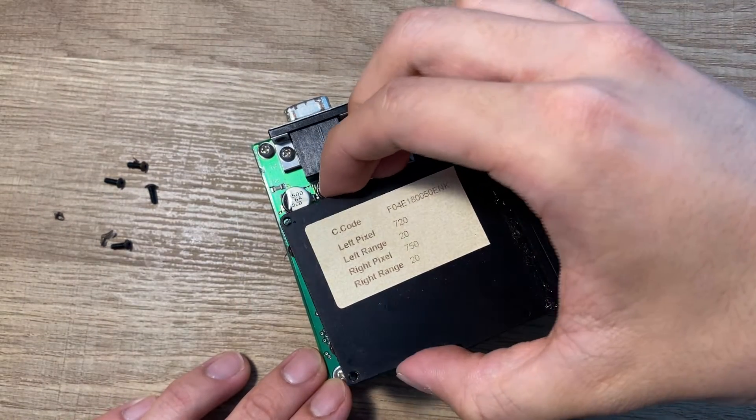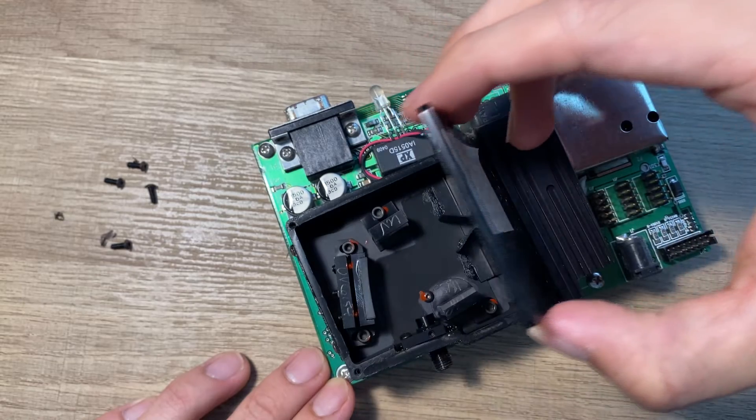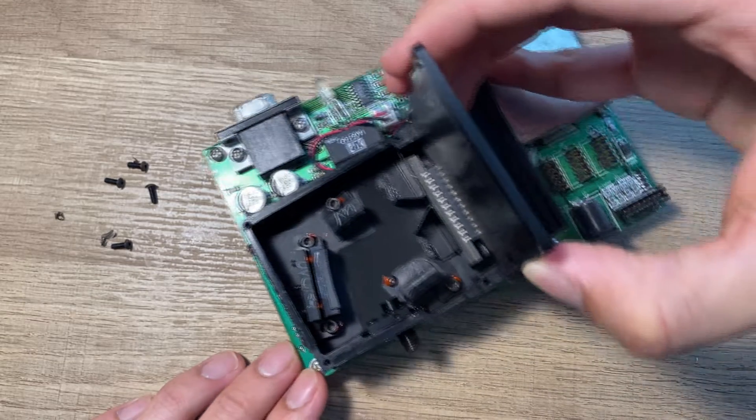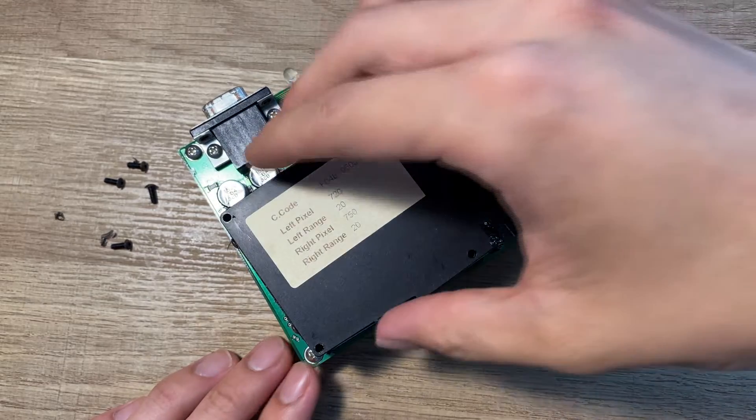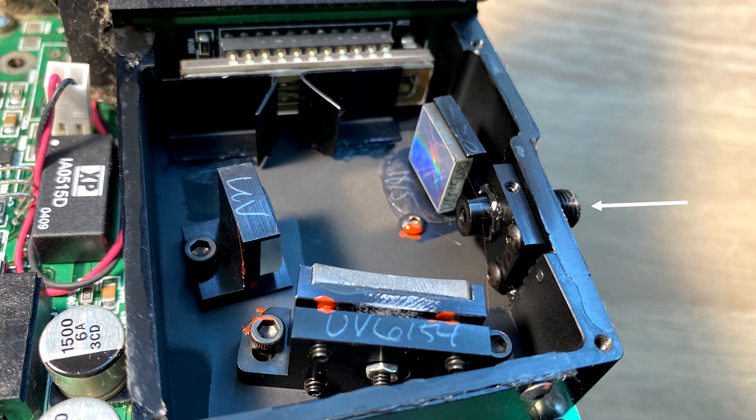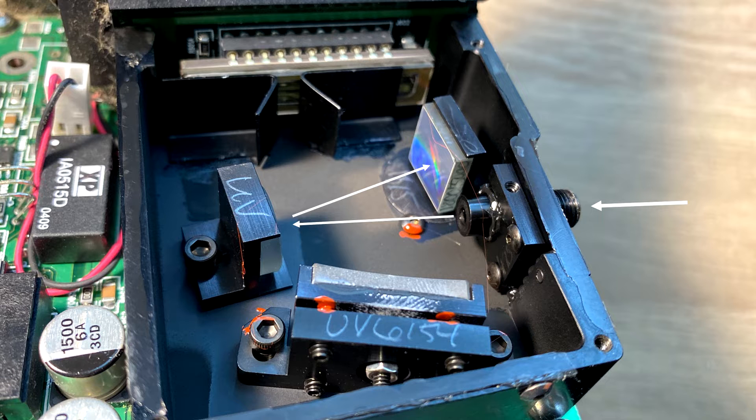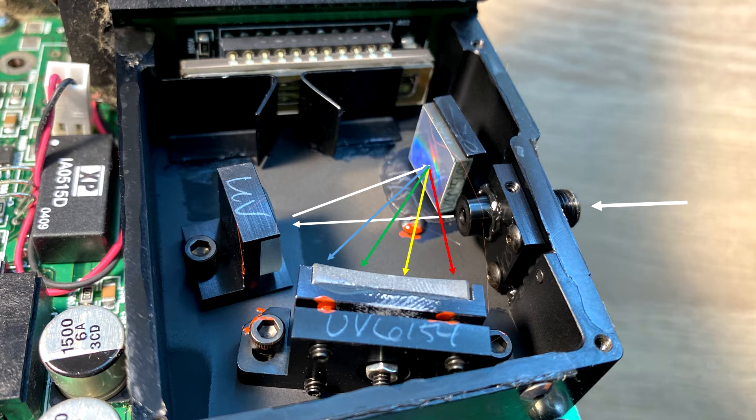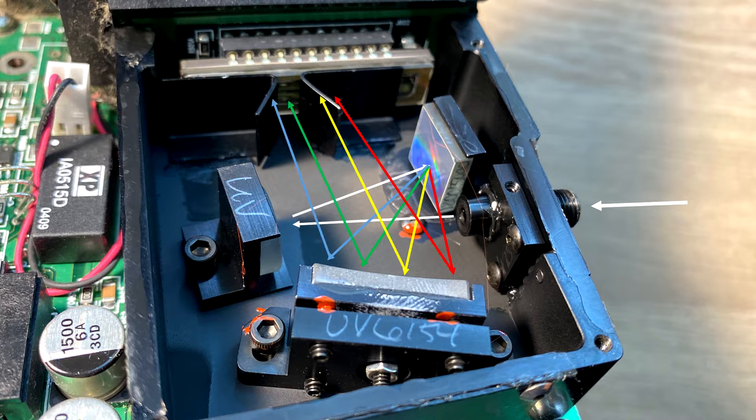I thought this a pretty sophisticated system and I really didn't want to accidentally break any of the optics. A light source is transmitted by the collimator through a fiber optics cable. The collimated light is then reflected by the mirror on the opposite end so that the light hits the grating's mirror. The decomposed lights are then reflected once again and the lights finally hit the linear CCD sensor module.